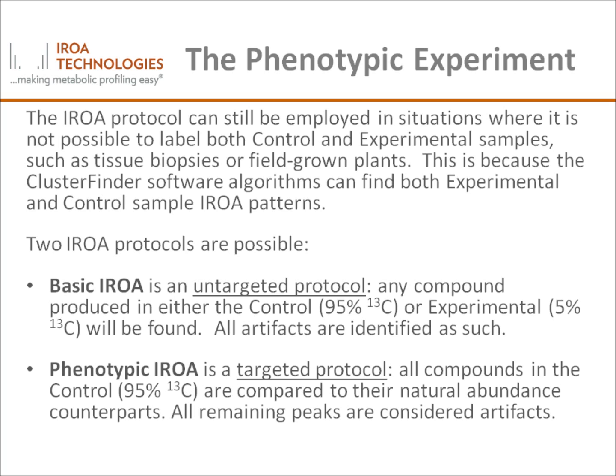The ClusterFinder software algorithms have also been written to find the control IROA patterns in molecules and then search for the unlabeled experimental metabolite pairs. Therefore, two IROA protocols are possible.